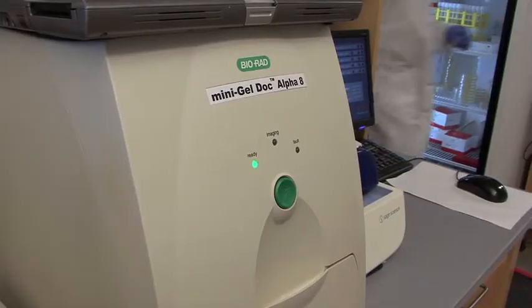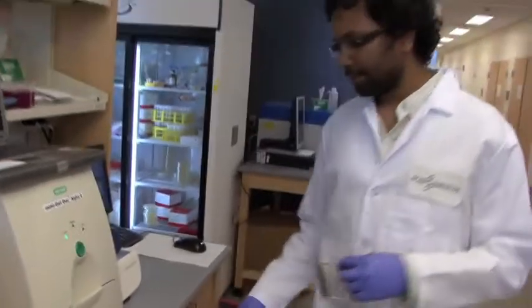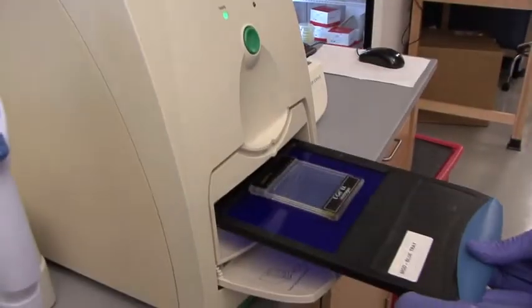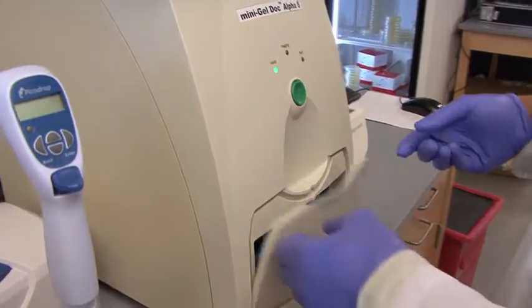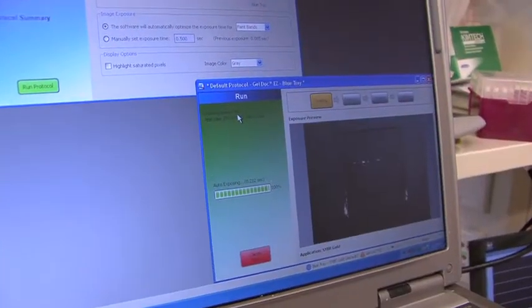I would say it would take about 5 to 10 minutes in previous gels, but each gel image now takes a matter of seconds, and if you're running through 10 to 20 a day, that adds up.